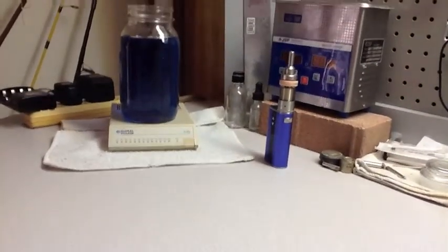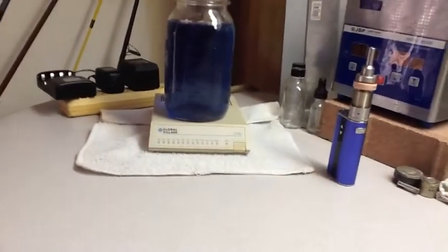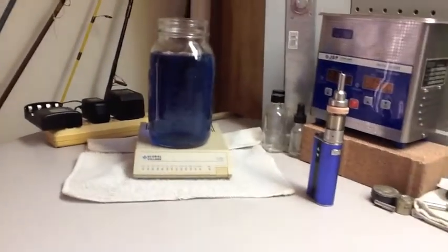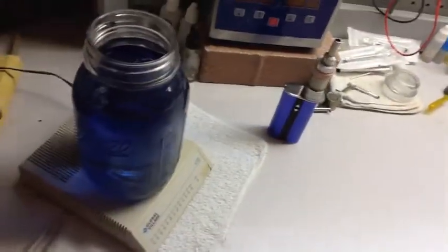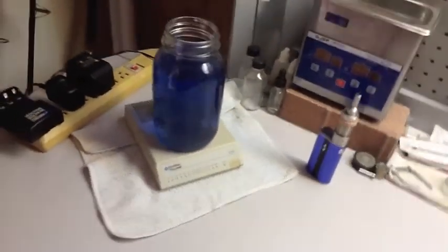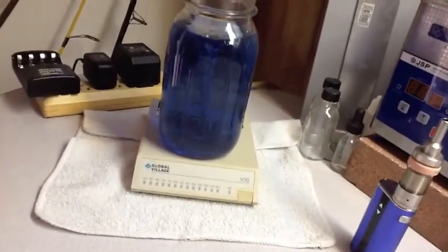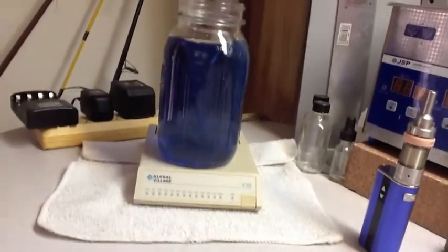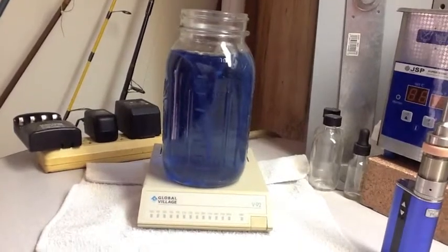Even though we're not done with the current build, I'm just going to quickly show you this is the other magnetic stir plate I made out of an old modem. I went ahead and threw 800 ml of water in that ball jar — you can hear the bar spinning around. And there goes the vortex. We basically have a tornado in a jar.